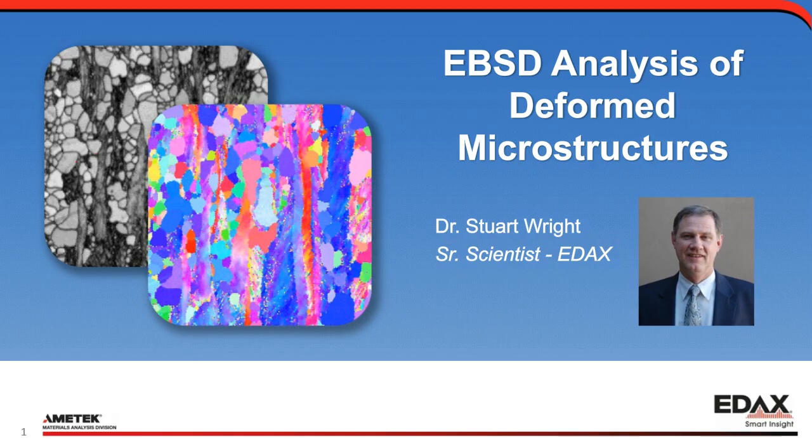Shortly after, TSL was founded. Stuart left Los Alamos and joined the startup company, commercializing the OIM technique, working primarily on software development. He has continued in this role through the purchase of TSL by EDAX. The original OIM system at Yale could index approximately one pattern in 3 seconds. Modern systems have come a long way since those early days, with speeds now exceeding 4,500 indexed patterns per second. Stuart is closely involved in the continued development of the technique, as well as in working with scientists all over the world in applying the technique to their materials research.